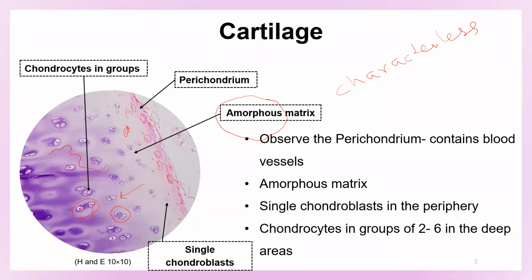In the middle of the white color, you see a dot of dark purple, that is the nucleus. These chondroblasts divide and give rise to more and more chondroblasts, and you see groups of cells. Generally, you can see 3 sometimes. 4 is difficult because when you cut it, you won't get all 4 cells. Here, I think there is one with 4, right?